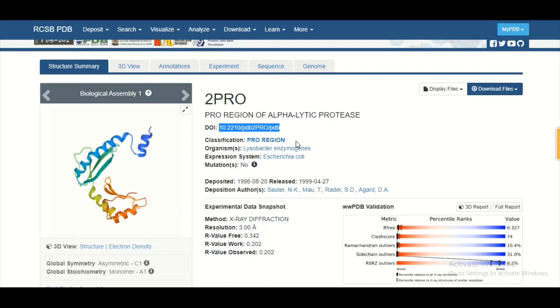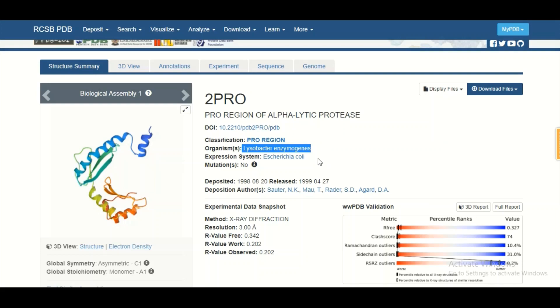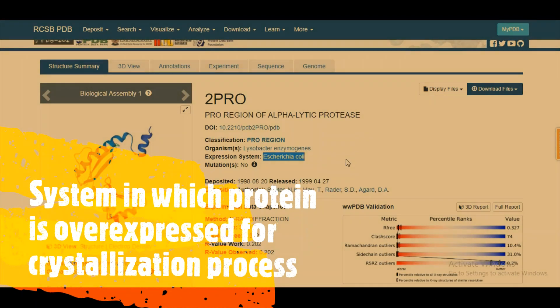On the fourth line, you get an idea about the classification of your protein. Right now this is a pro-region protein, but you can find different classifications here — for example, oxidoreductase class for oxidoreductase enzymes, transferase class for transferase enzymes, and so on. The next line tells you about the organism from where your protein belongs, and the line after that tells you about the expression system used to overexpress your protein for crystallization purposes.